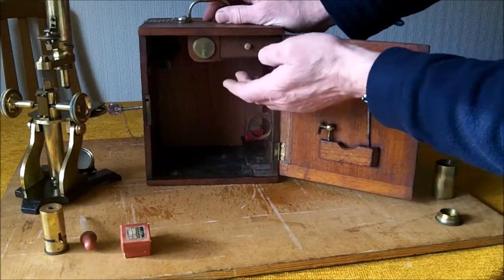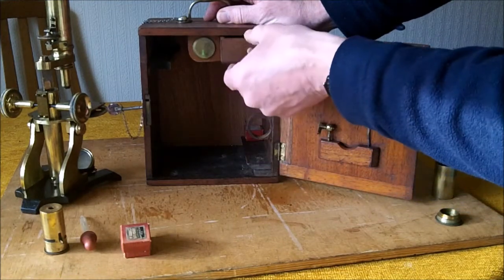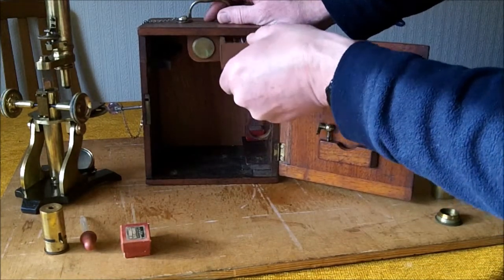It also needed all the wooden fittings that had broken, and the slide drawer which was also broken had to be repaired.